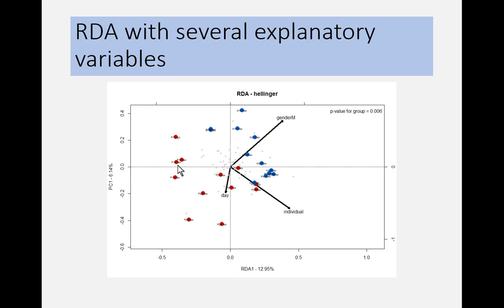Now, in Chipster, the dataset has been Hellinger transformed, which should at least partly take into account that problem. So, well, let's say that's the state of the art, but that's for the ordination analysis almost as state of the art as it gets. But certainly you can use something different too. I haven't actually seen any papers comparing those methods directly in so much detail, so I couldn't comment which is better.